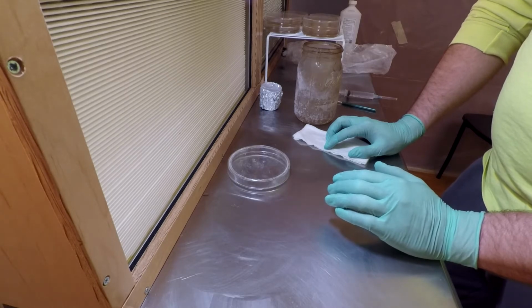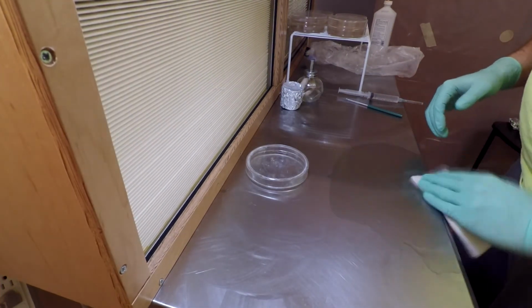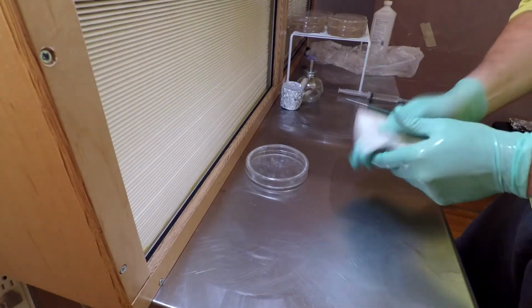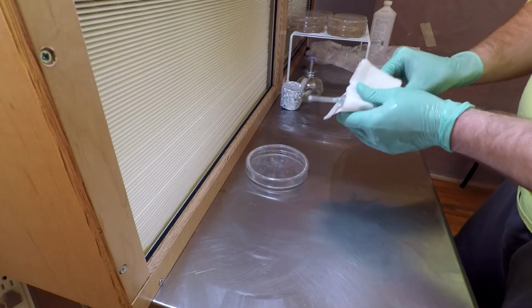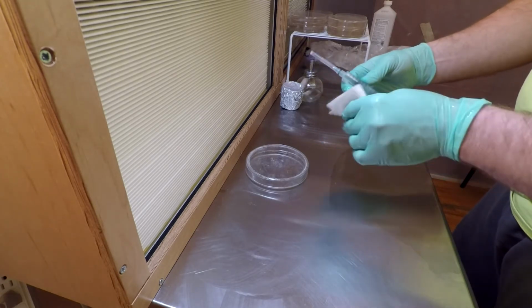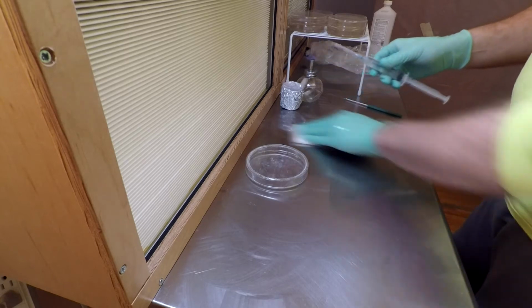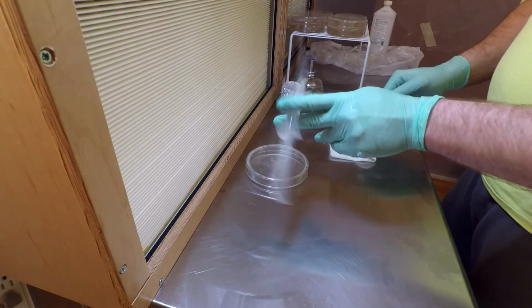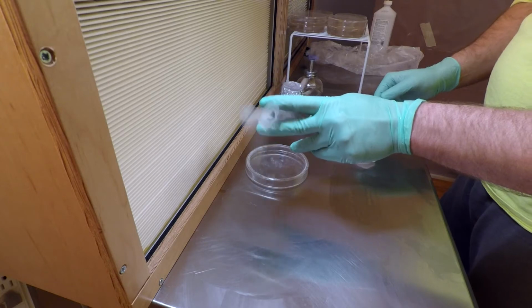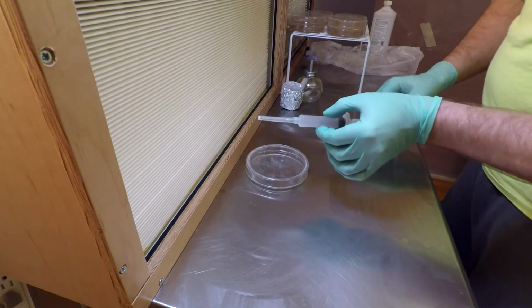And then we'll get into using an inoculation loop to spread out some spores very thinly. You can see I have my alcohol lamp going. Clean this syringe up just a tiny bit. I chose one of the syringes of spores that didn't have a whole lot caked up in the bottom of it. Try to thin it out even more. Give it a mix. Still very cloudy in there with the spores.